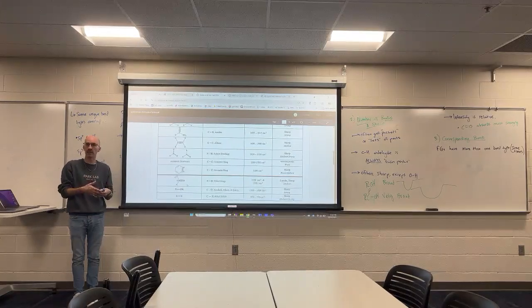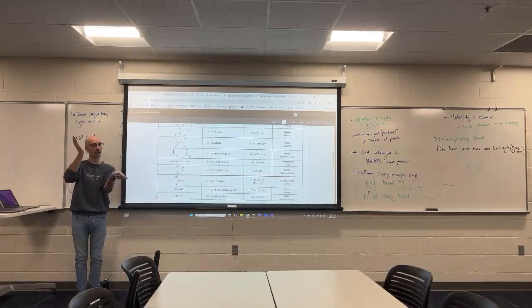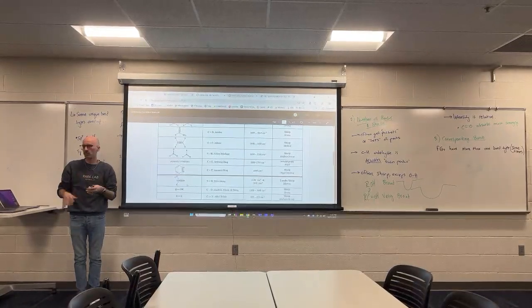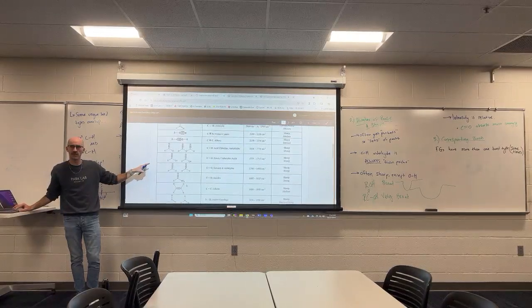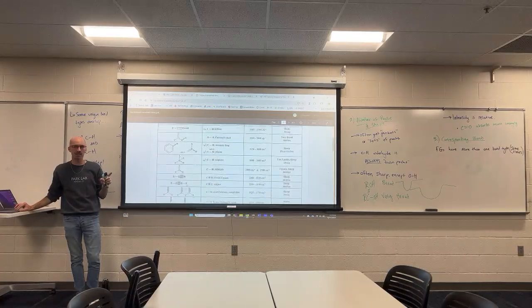For instance, if I see the CO double bond absorption and I see the CO single bond absorption, oh, well, those correspond to an ester. Or they might correspond to a ketone and an alcohol because I've got the CO bond. Yeah? So there are a few functional groups here that can be really challenging to differentiate from other things, except that they should always have more than one bond type that shows up.